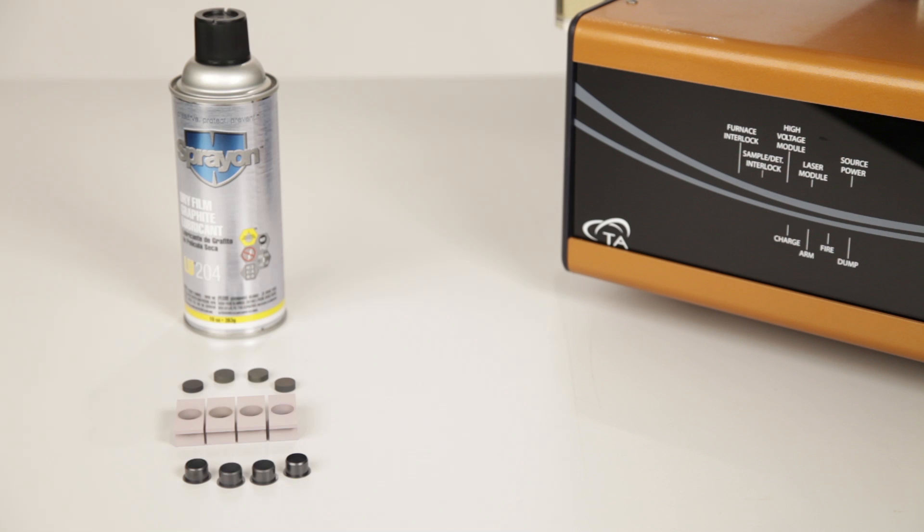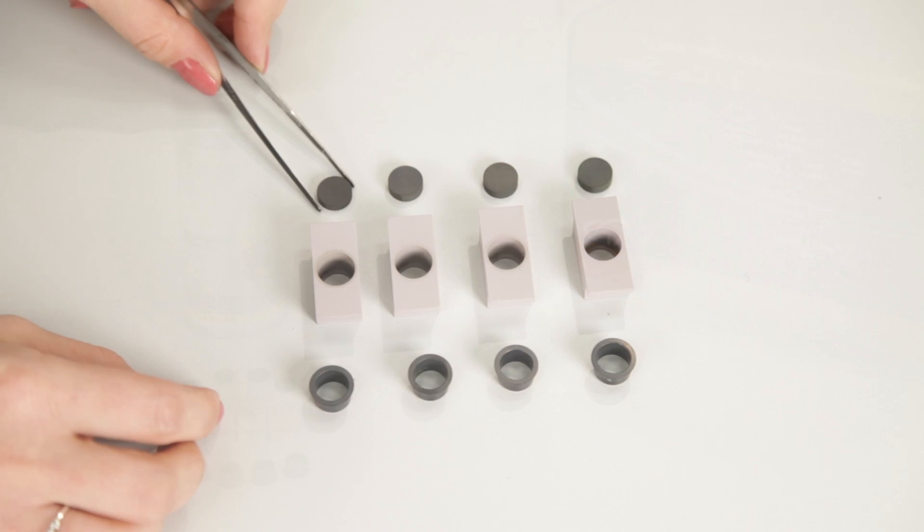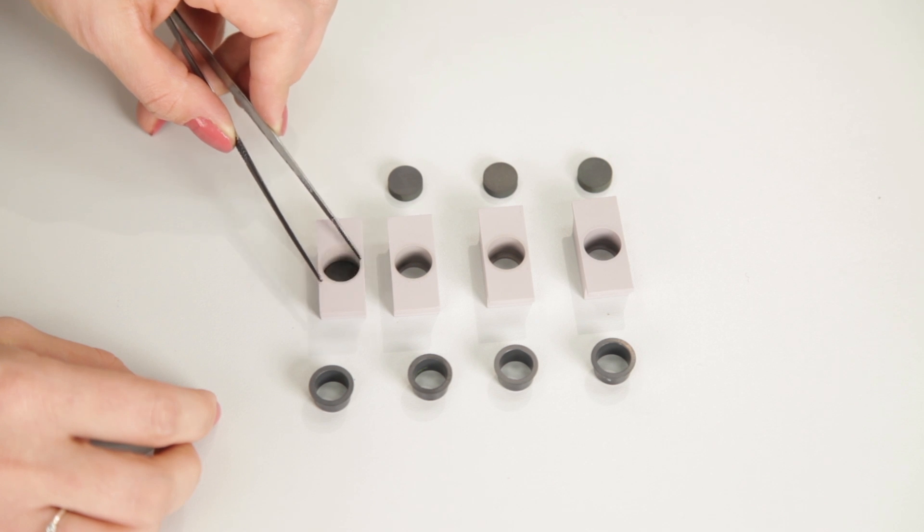After choosing the appropriate reference sample, we graphite coat it together with the unknown samples to make sure they all get a similar thickness of coating.